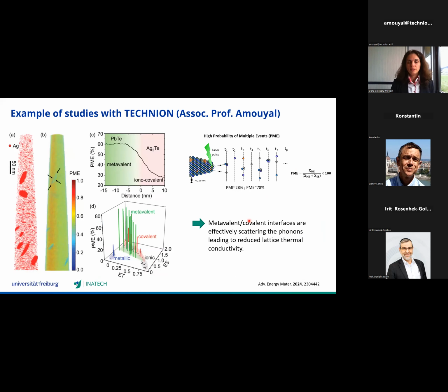Now, this is another very interesting aspect for thermoelectrics, where it shows nicely the capability of the atom probe to probe bonding. Bond means the region between the atoms, right? We very often schematize that in chemistry with a small line, although in physics it is more like a cloud of electrons around two atoms.